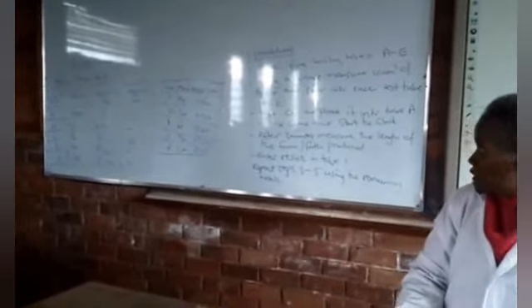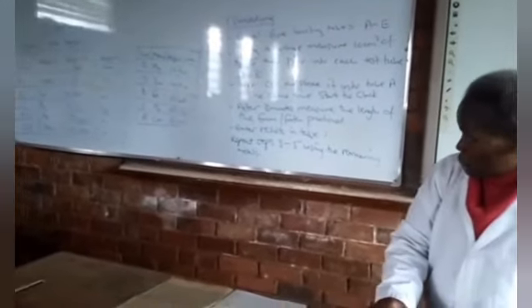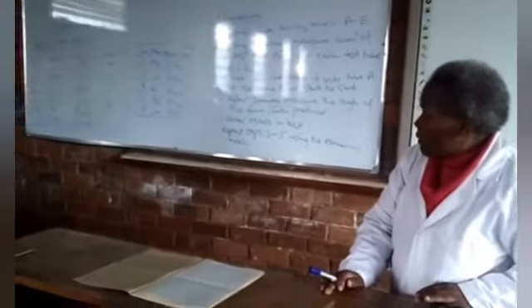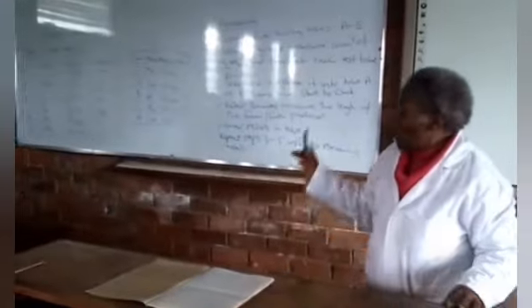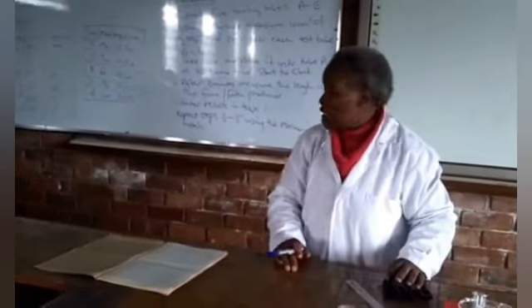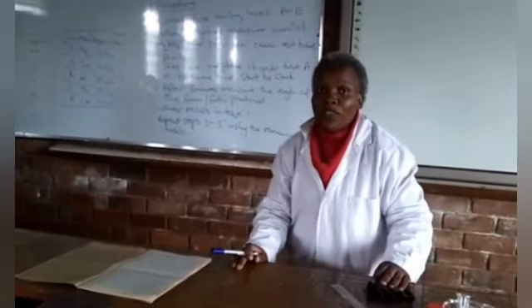Okay, so using our heights, we can now tell which metal is the most reactive and which metal is the least reactive. Okay, so magnesium is the most reactive metal on the list of the metals which I brought, followed by zinc, then iron, and lead, and copper is the least reactive. And from this experiment, we can also conclude that copper does not react with dilute acids, and if that's true, it's in your textbooks, and it also does not react with water.